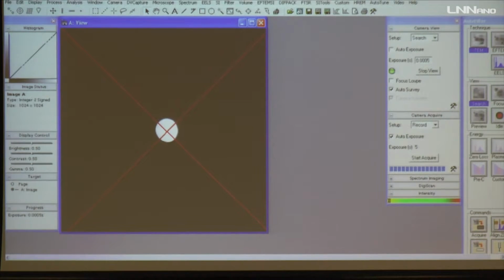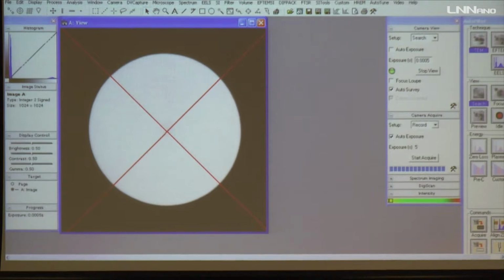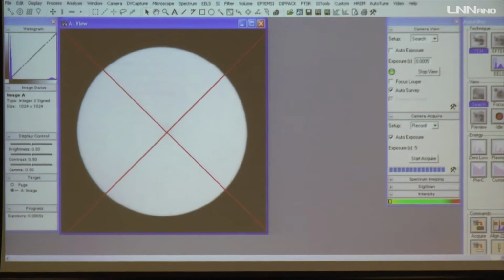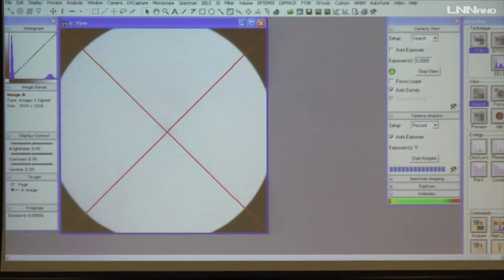So it's in the center, that's good. And it's opening concentrically about the optic axis. That's perfect. So that's nice. Next, we search for a good region on the sample. For doing that, maybe I will move the sample using the stage.